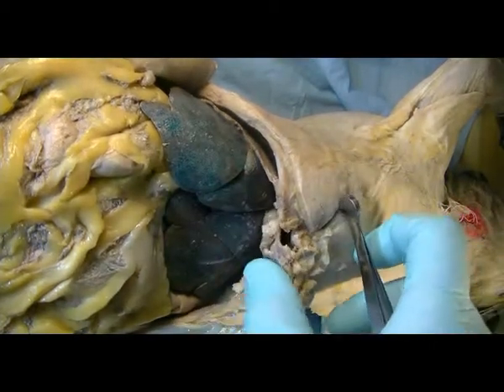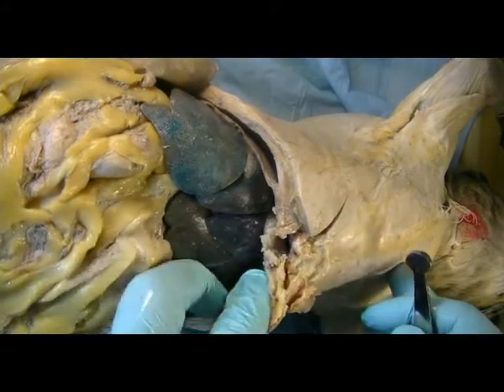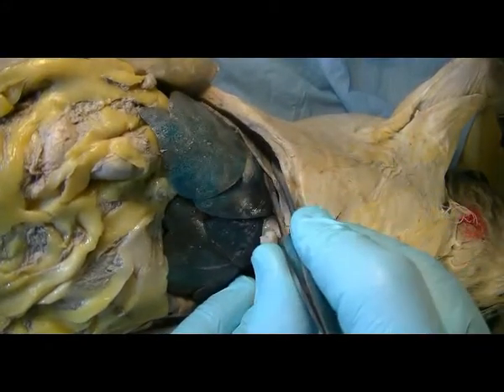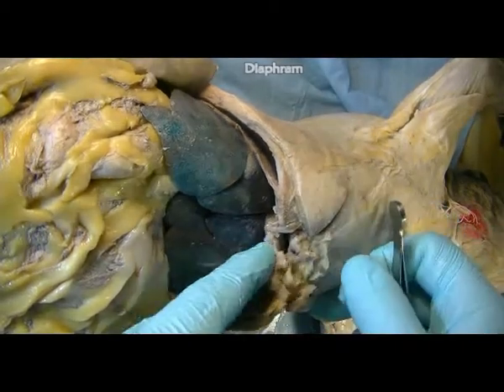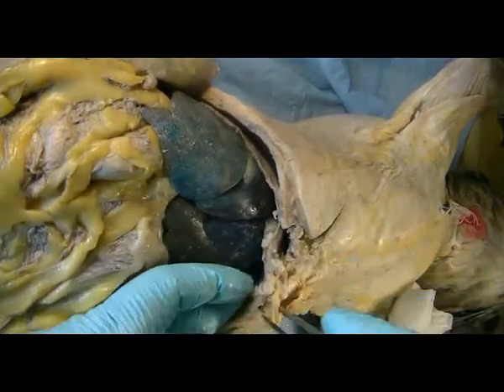Okay, here's the cat. I've moved in a little closer to the liver to show you some other structures. Here you can see the diaphragm, which separates the abdominal cavity from the thoracic cavity.